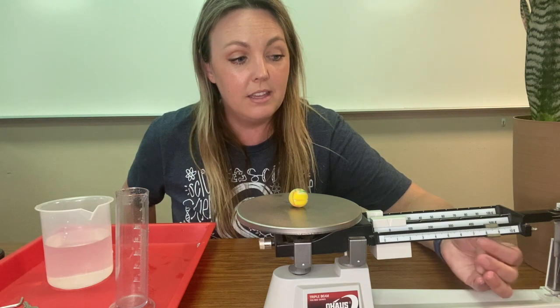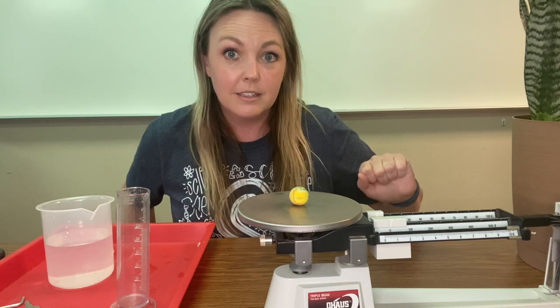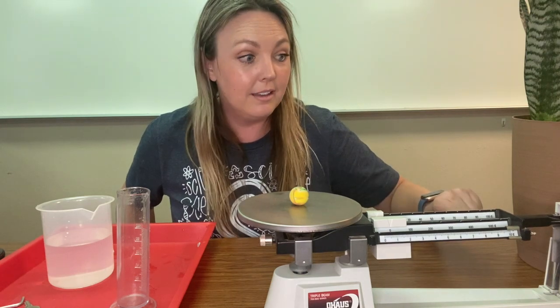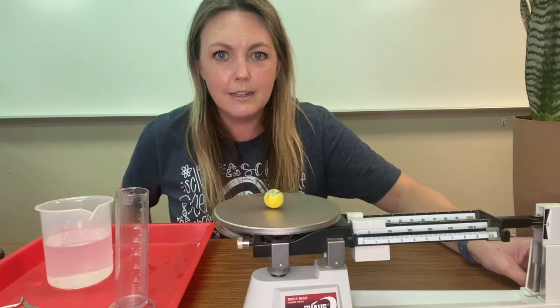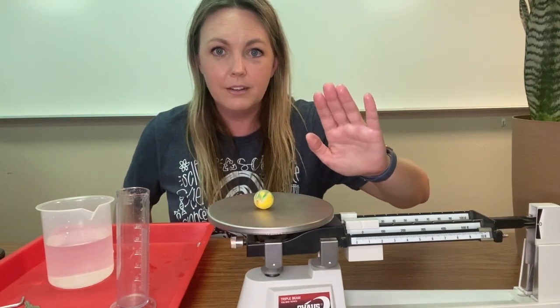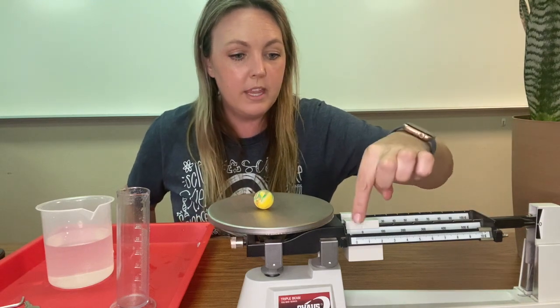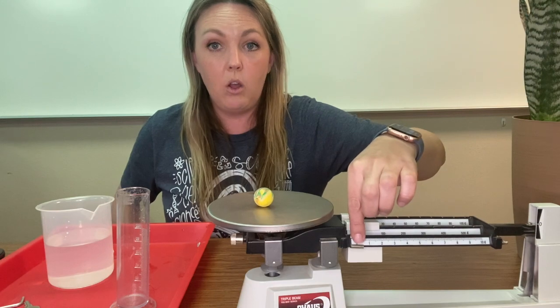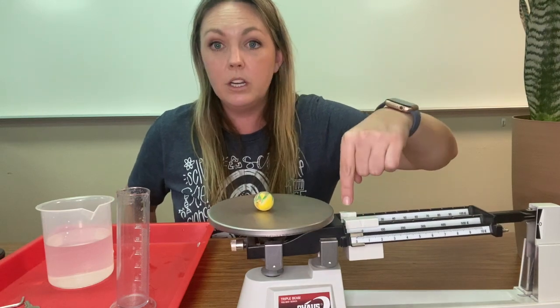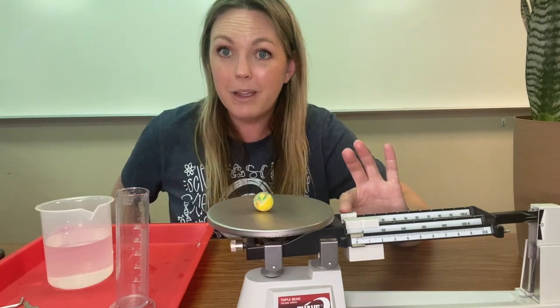Looks like this bouncy ball has quite a lot more mass than the last object. Just a little bit more. So this went all the way to 10, which means we have to bring it all the way back to the beginning, and then we're going to jump to the back bar because this one counts by 10s.